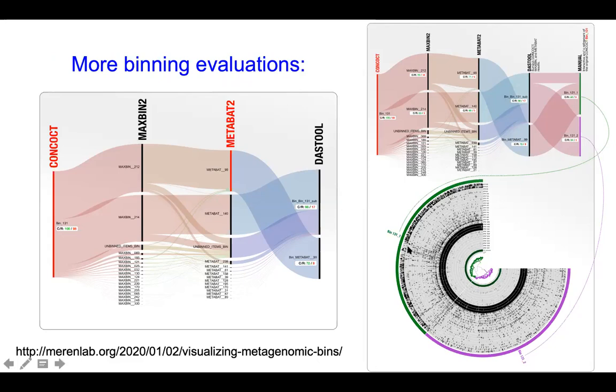In this case, it can be questionable what this area over here in roughly the middle of the green bin is. While the abundance in these three samples at the inner ring agrees relatively well, there seems to be differential abundance. So this might be a mobile element of some sort.